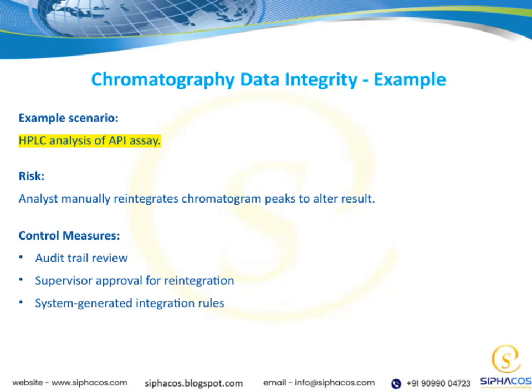Let's take a look at this example of chromatography data integrity. Imagine we're dealing with an HPLC analysis of an API assay. Now, one risk here is that an analyst might manually reintegrate the chromatogram peaks.